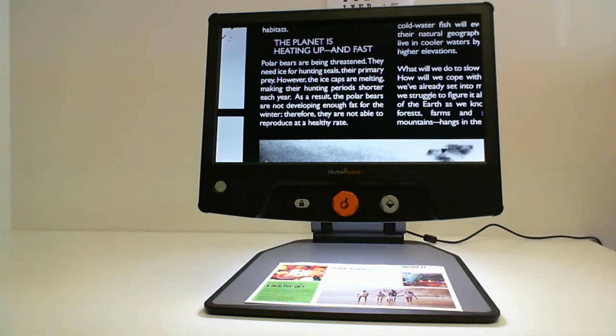In today's little tutorial, I will be talking about some new features offered in version 1.1 on Reveal 16.